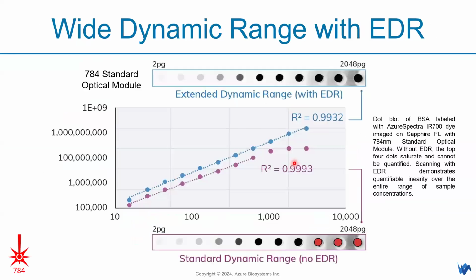Okay? And the fluorescent signals are also supported with a wide dynamic range with the extended dynamic range function, okay, for fluorescent signals. So it allows you to generate a single field of view image where your analysis software is able to visualize a weak signal while not saturating the high intense signal as well on the same image. So with that, all the fluorescent signals captured in this are supported with the EDR function.